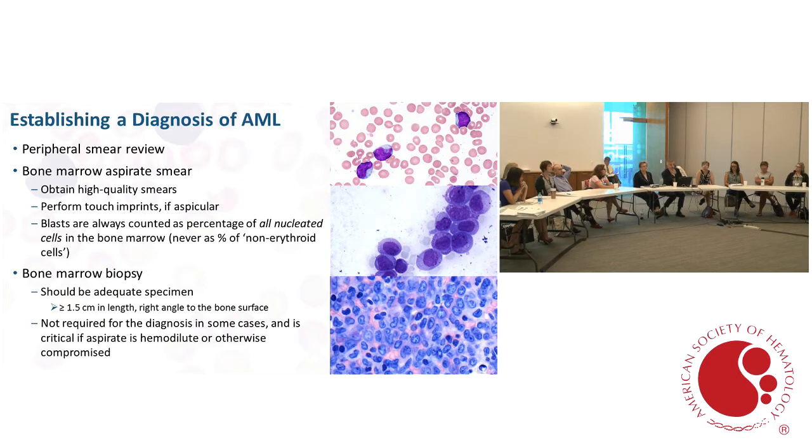One thing I will say about the biopsy is make sure a touch imprint is done, particularly if you think the aspirate might be compromised. I think that's really critical. Most of our hematologists will do that, but occasionally we get a core and there's no touch prep performed. And they say, well, it was a dry tap. And I say, well, but you had the core before fixing it.